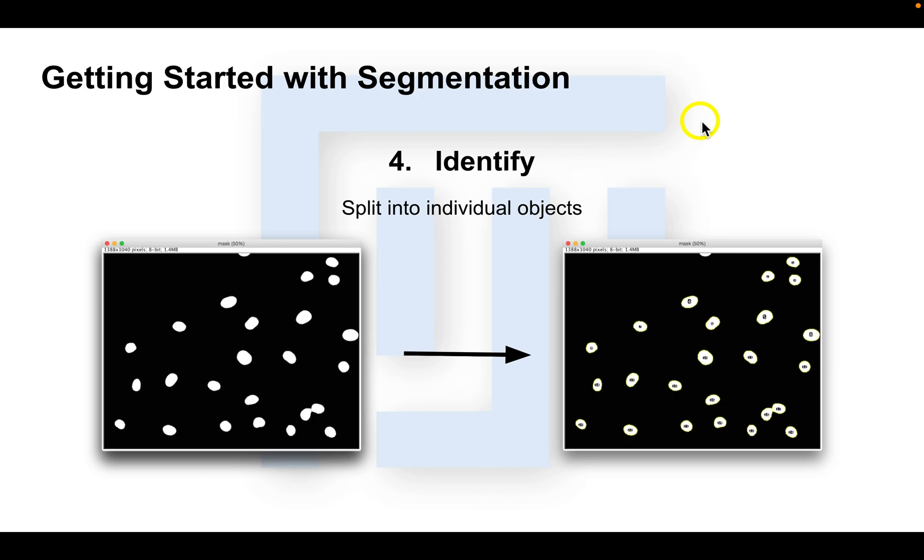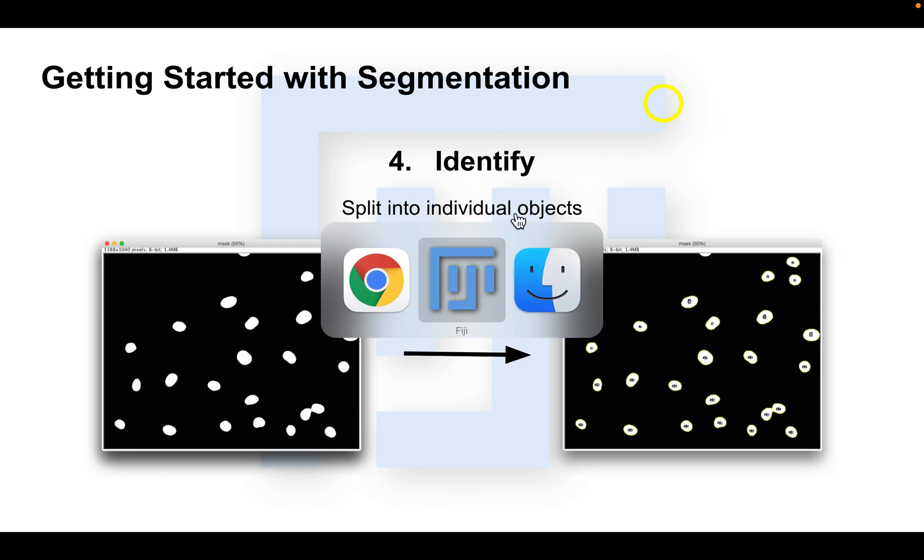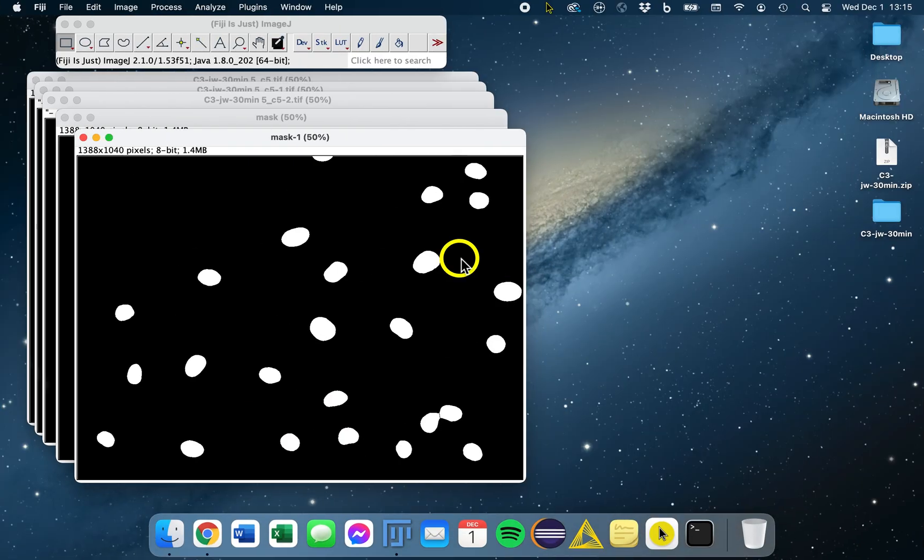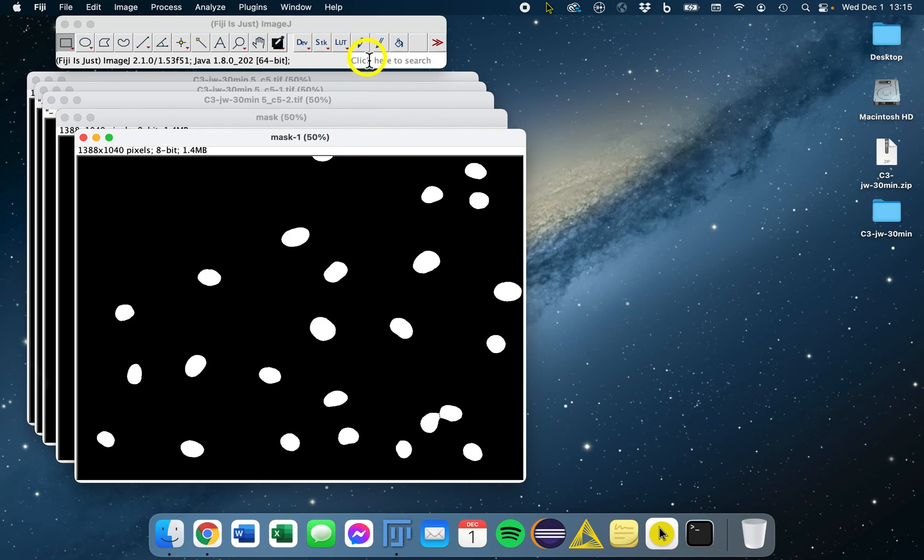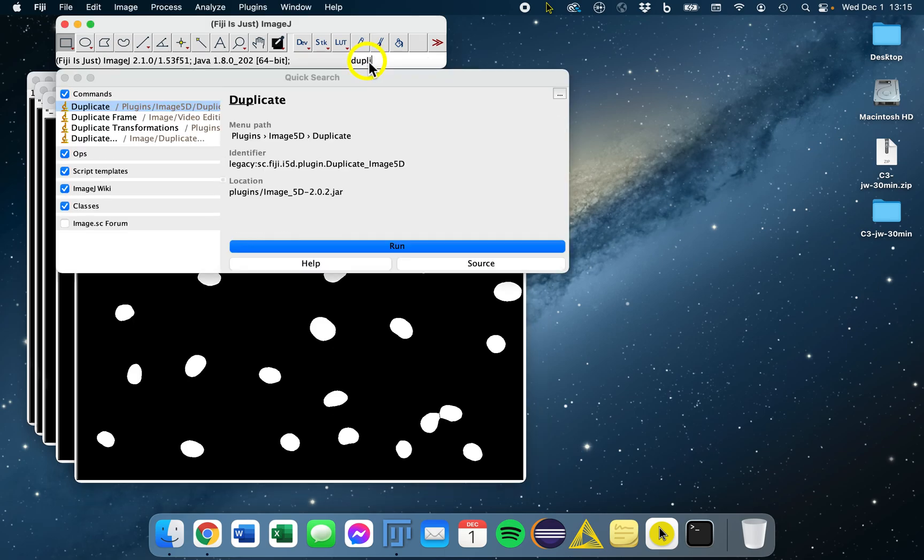Now that we are happy with our objects in the binary mask, we can delineate them using the particle analyzer, which will help us split up our mask into individual objects. It allows us to make selections, save our objects, and also measure them. So we'll go on to Fiji. Here we have our mask that we're happy with. The first thing we're going to do is duplicate.